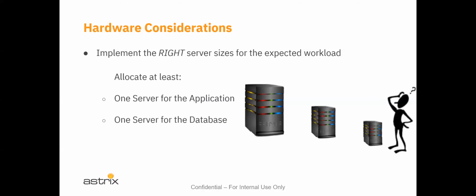Typically, they've got a system administrator that's out there handling that third-party software, but you'll be coordinating with that, I was going to say DBA, but it's a system administrator, an SA, to manage connectivity and IP addresses and instance names for the application servers that are being installed for STARLIMS. At the very least, though, you're going to have one server for the application and one server for the database.